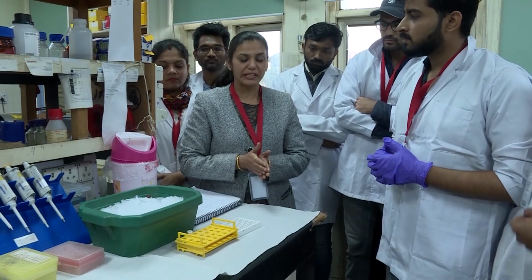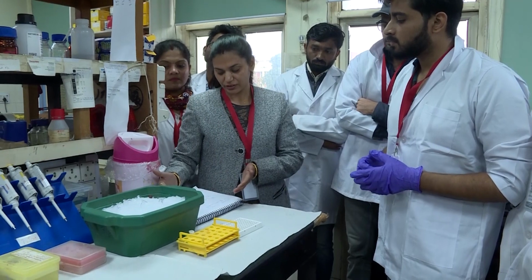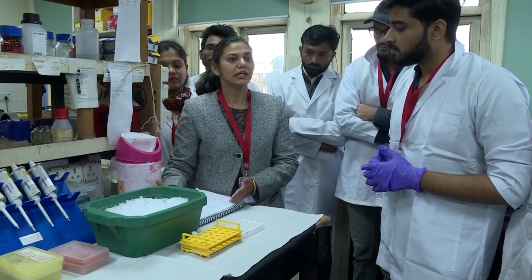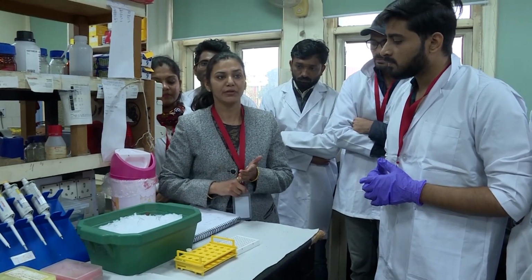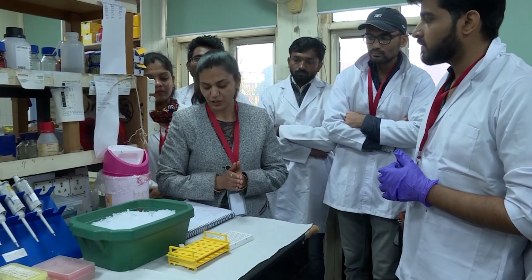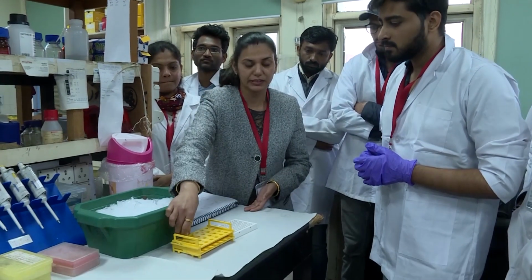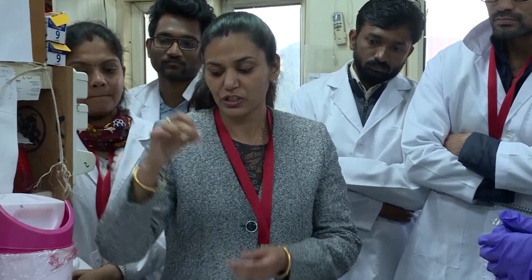The cDNA is already prepared here, so we will set up the reactions. The reactions are in duplicate, so in total 8 reactions: one control, one treatment, then one gene and one endogenous gene, in duplicate. So total 8 reactions we will set up. First we will take water, and in this reaction 1.5 microliter. Here we will first make a reaction mix.